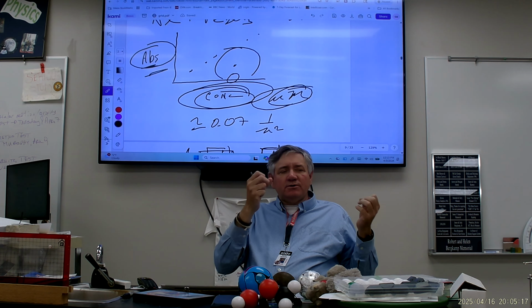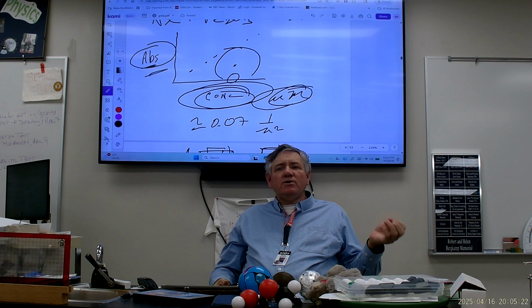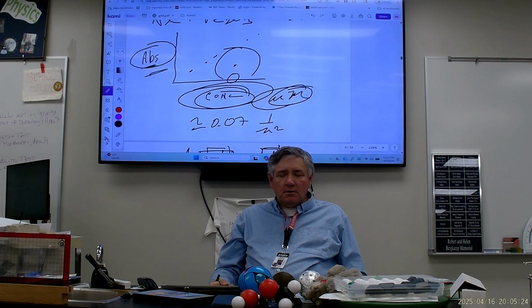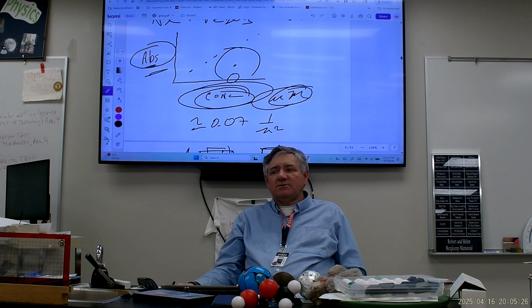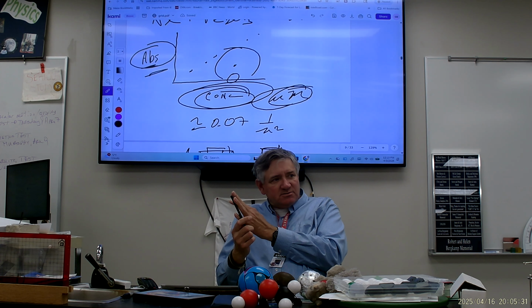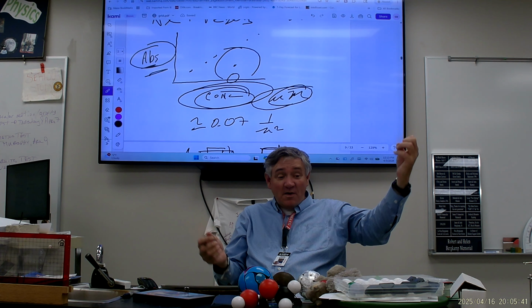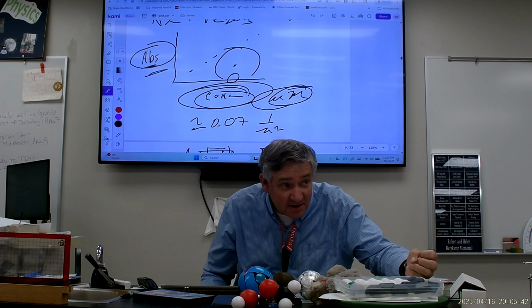Now, keep in mind you were doing a series of dilutions, okay? So what could have gone wrong in that process? Did you add too much water? Did you add too much of the crystal violet? It's not human error. But human error, specify. I'm just saying you can't say human error. Yeah, you have to specify. If you specify what that human error is, I'm cool with it. But just to say, oh, it's human error, okay? No. Like physically something had to happen.